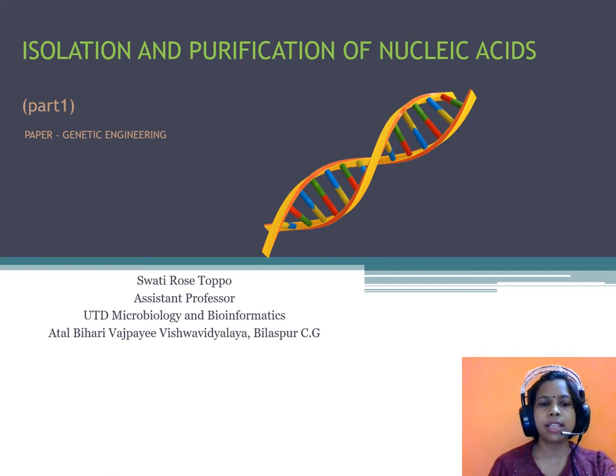So before discussing the common methods to detect nucleic acids and tools and techniques in genetic engineering, let us learn about the isolation of pure form of nucleic acids. So today we are going to talk on the topic isolation and purification of nucleic acids, and this lecture comprises part 1.